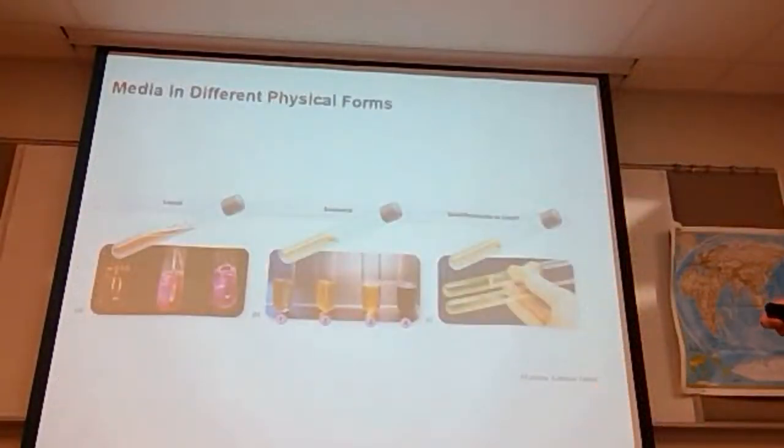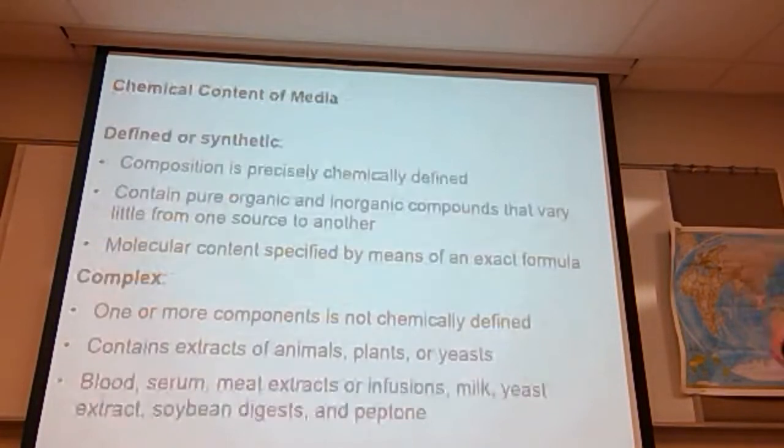Again, here are some different types of tubes. There's the liquids, there's the semi-solids again, and the solids, which can be reversible to liquids.